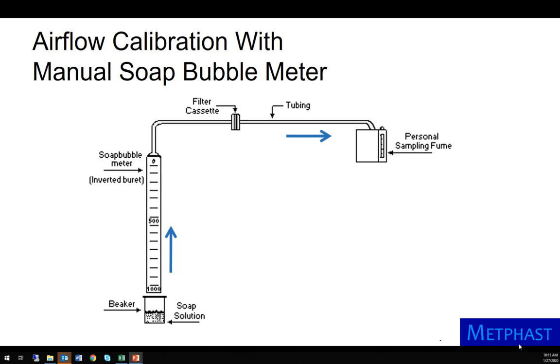This meter can be a primary standard if the volume of the burette is traceable to NIST. To calibrate air flow, the soap bubble meter is connected to the end of the sampling train. The sampling train is operated with the same collection media as will be used in the field — here, a filter cassette with a filter. The sampling pump is warmed up for several minutes, then the air flow is measured using the soap bubble meter.